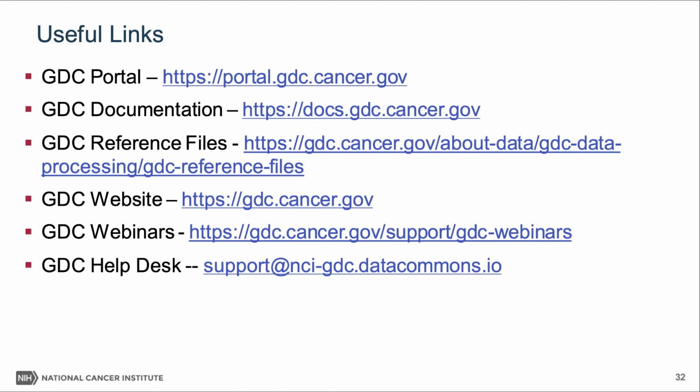Yeah. And for the existing analysis we have done, in the GDC documentation we have lots of information about how this workflow was constructed. Sometimes there's detail down to the exact command line. Two of the workflows we mentioned here: one is the Sanger whole genome variant calling workflow. For this one, we adopt directly what Sanger have provided, so we have a link over there. It's easiest to just go to the Sanger documentation, and they provide a lot more information than what we have.